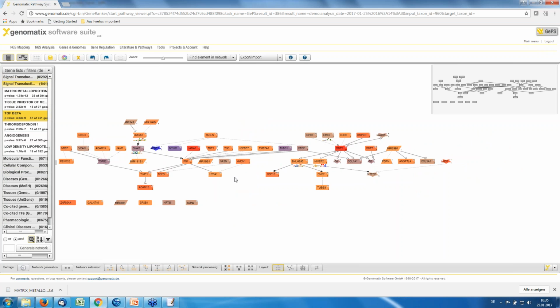We see that we have both upregulated and downregulated genes. So upregulated again in red or orange. You also see the measurement values here, the log fold changes in the tooltip. So 1.925 here for this LDBP1, or this one with a darker red or stronger red, 4.415. Downregulated genes are in a blue or purplish color, like one here minus 2.6 and this one here minus 4.5.